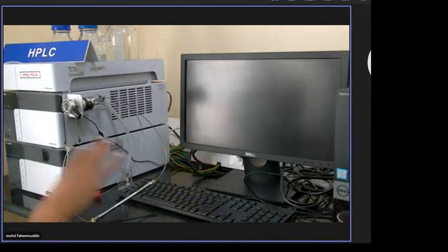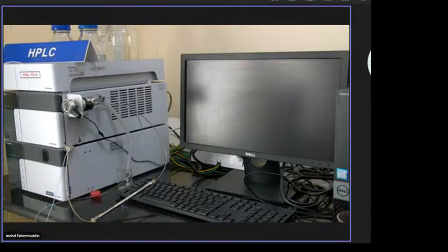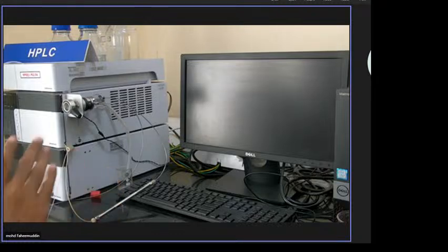Okay, so we are doing the manual thing. Usually in industry they will construct the standard graph once, and the remaining are all samples only. Once only the standard graph, all are samples. For one standard graph there are 500 samples. So for 500 samples, there is a big tray, and they will fill the samples numbered 1 to 500, label them, and then keep the tray inside. The instrument is running 2 days, 3 days. They are only taking the data, that's all.